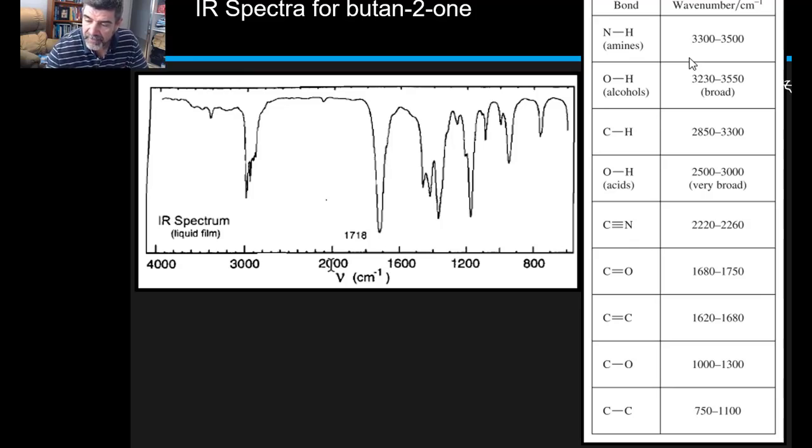When you look at the output from the datasheet, the OH groups are up in the 3200 mark, but so are the carbon-hydrogen bonds.